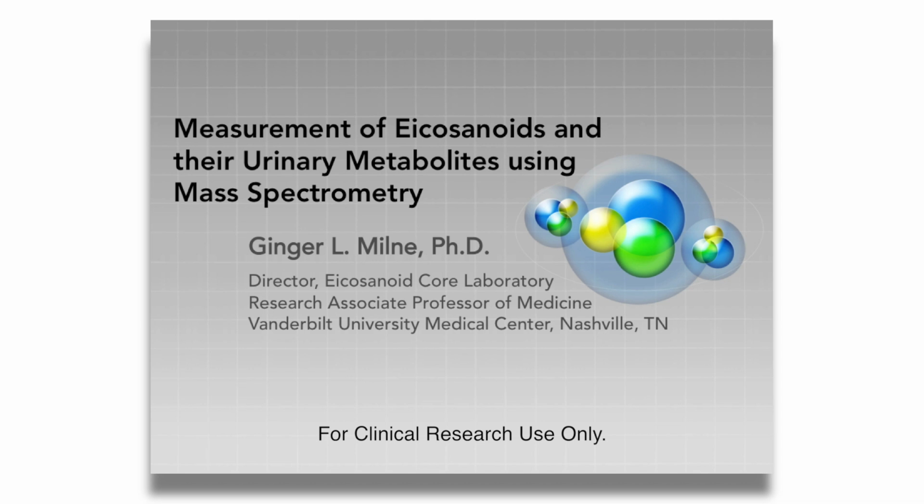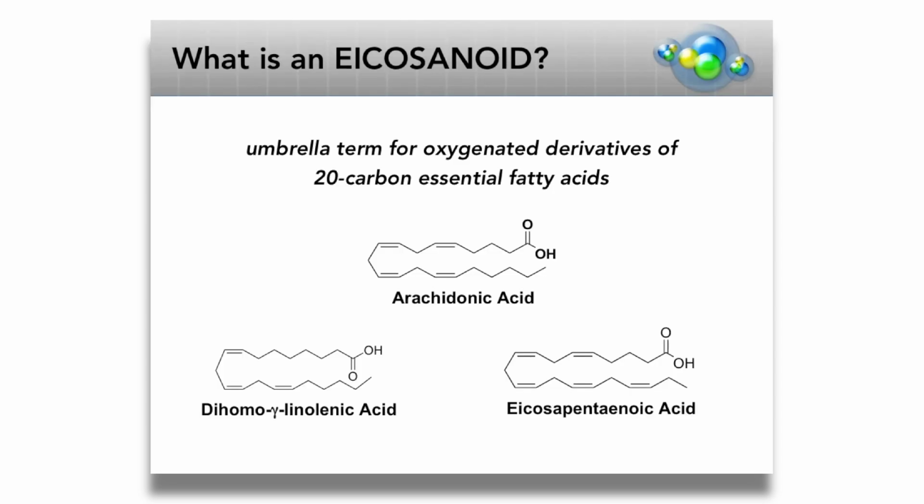Hello. Today I will be discussing the measurement of eicosanoids and their urinary metabolites using mass spectrometry. First, what is an eicosanoid?